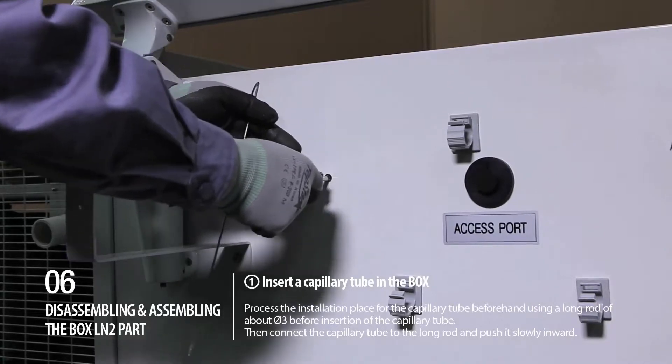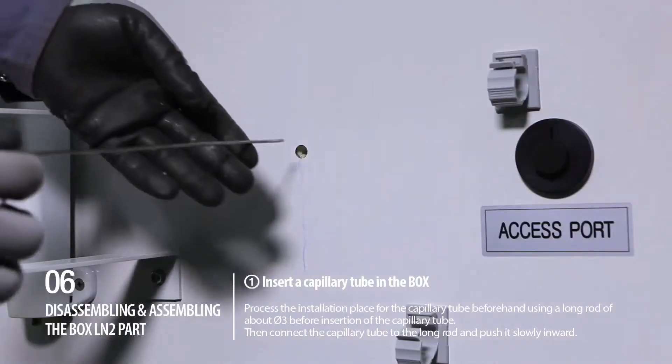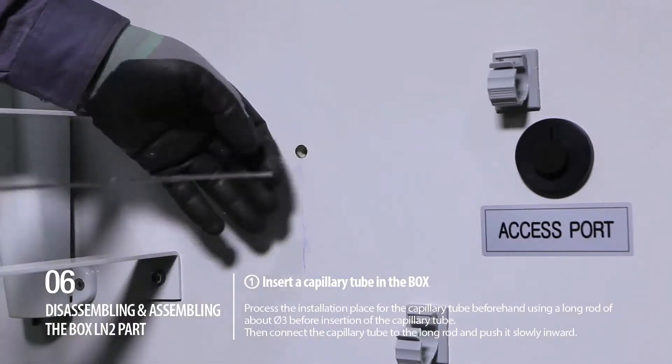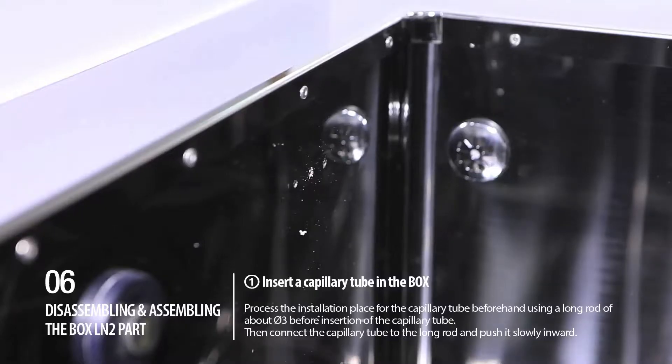Step 1: Insert a capillary tube in the box. Process the installation place for the capillary tube beforehand using a long rod of about diameter 3 before insertion of the capillary tube. Then connect the capillary tube to the long rod and push it slowly inward.